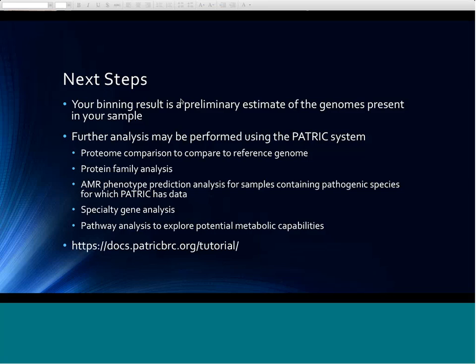Okay. Can you upload bins and have them run CheckM and local quality check tools? Not yet, but one of the very next things coming into PATRIC, we will be adding the quality checks. I'm begging, I really want this. And Bruce really wants this. We are adding to the general genome assembly and genome annotation service in PATRIC. We're going to support CheckM and consistency tests and the generation of quality reports for every genome that you run through PATRIC. Right.